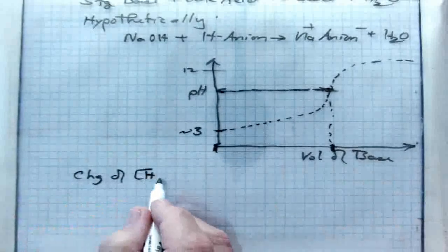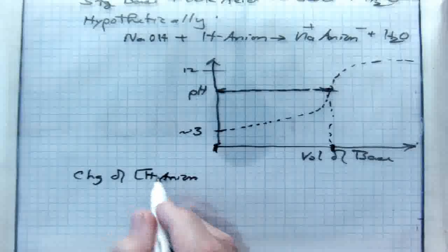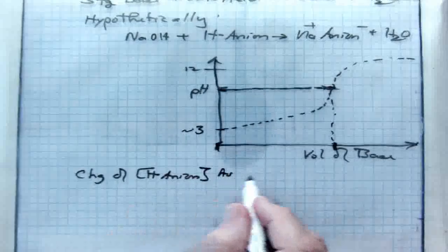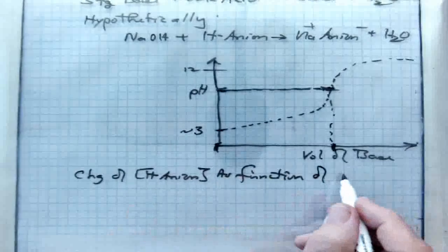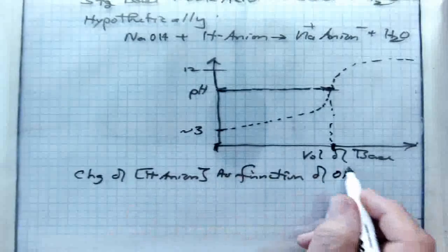At the point right here, at point A, the titration has not begun.